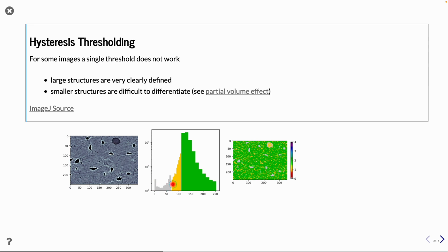Now we set two different thresholds, one which is quite restrictive and one that is more generous. Looking at this image, you can see that we now have the colors green, gray, and yellow in the image, and most of the small items land in the yellow part, and the larger items land rather in the gray part. So there we already have a distinction.